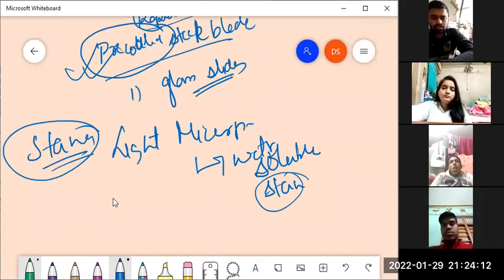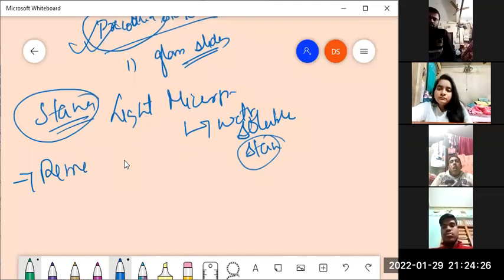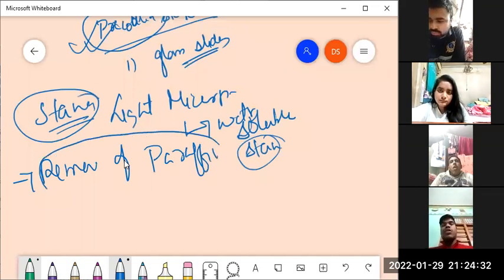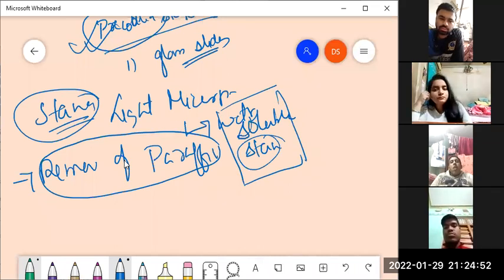Now, one thing is necessarily to be performed before we ensure that the tissues are getting sufficiently stained. And that thing is the removal of paraffin. See, the paraffin was necessary for sectioning. But once we have already sectioned the tissue, if we still retain the paraffin, then that retained paraffin would interfere with this water soluble stain, because we know that paraffin itself is not water soluble.